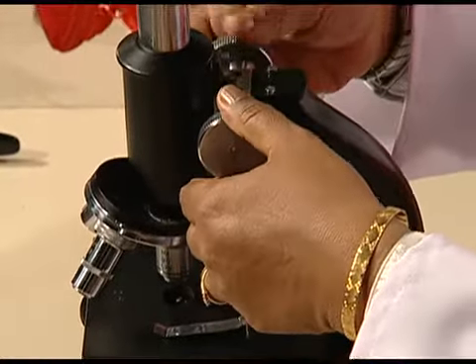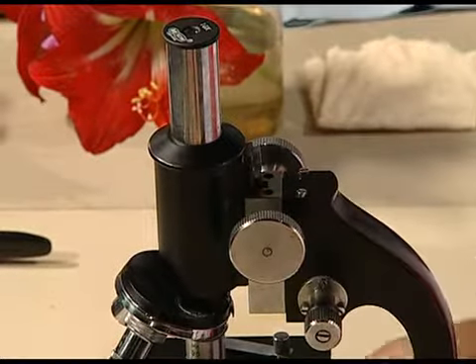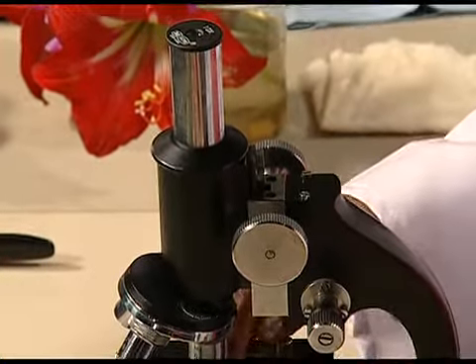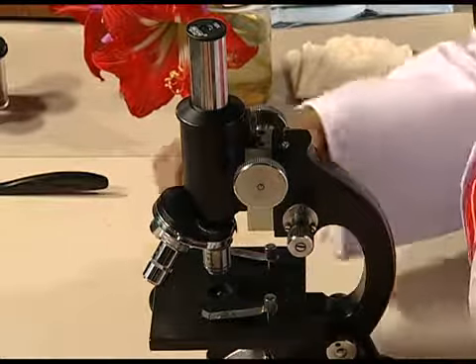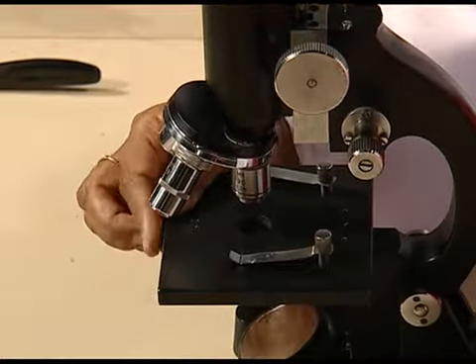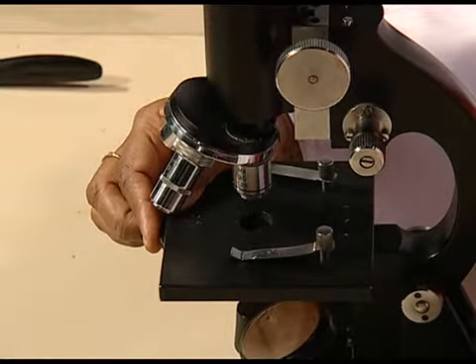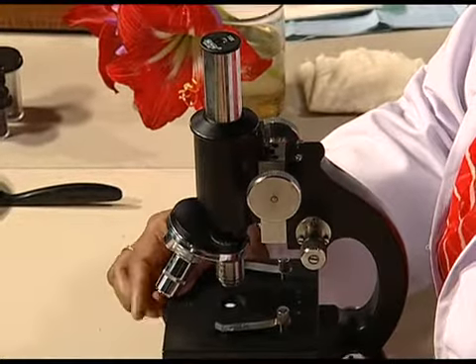After that, raise the low power lens away from the stage. This lens should be facing right above the hole on the stage. After that, adjust the light source and the diaphragm. Here is the diaphragm. As I told you earlier, it has holes of different sizes. Depending on the amount of light that we need, we can adjust the diaphragm.